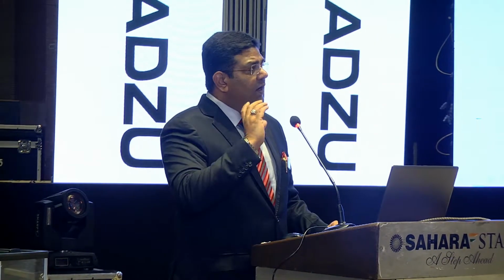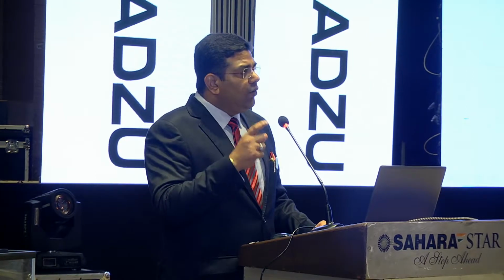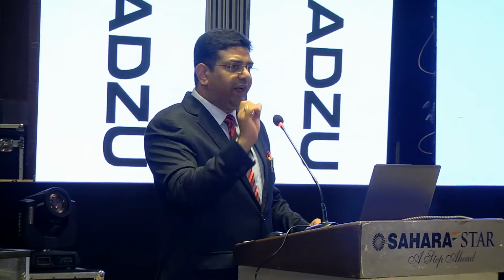So Stablo is altogether a different business. With the AP series, you can have an external Stablo ionizer, or you can order later and upgrade it with the built-in one. The engineers can show you how to install it. It's very easy. So ionizer, a different market; super range balance, a different market; Lab Solutions, connecting multiple balances, a beautiful market.